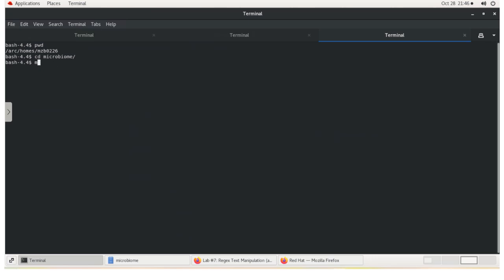A few things that I haven't mentioned earlier in my first QC scripting. For a directory you use mkdir, right? But for making a new file, any kind of file that is not a directory, you can use the command touch and type the script name or file that you want to make. So for us it's fasta .sh.